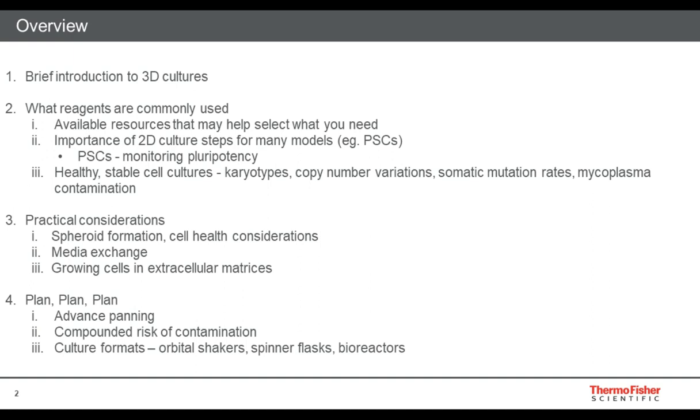But regardless, if your background has been primarily or only working with traditional 2D monolayer cultures, there are some not subtle things you will run into quickly that may present challenges to newcomers to 3D cell models. And lastly, we'll talk about some other advice points, tips and tricks, and things to be aware of for people interested in exploring or moving into a 3D cell culture workflow.